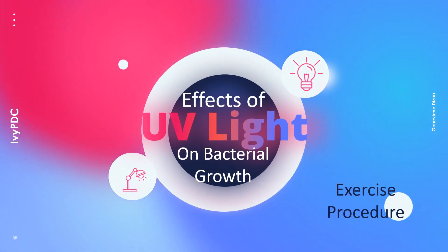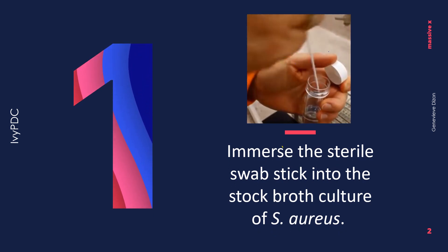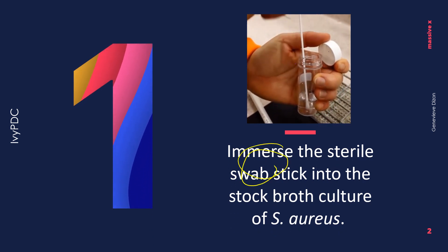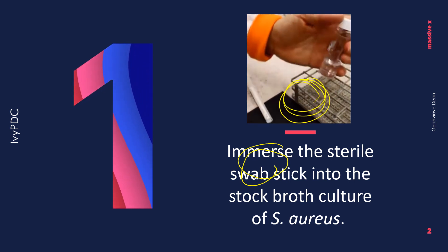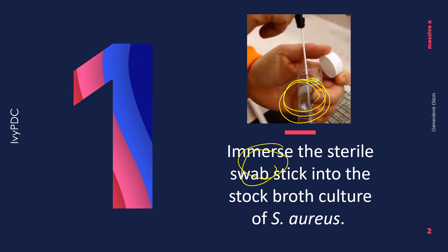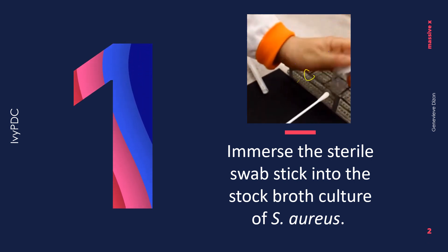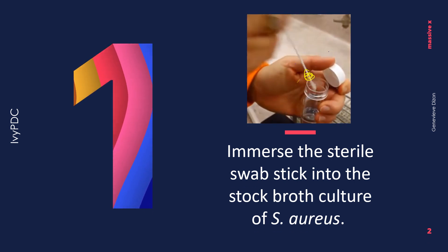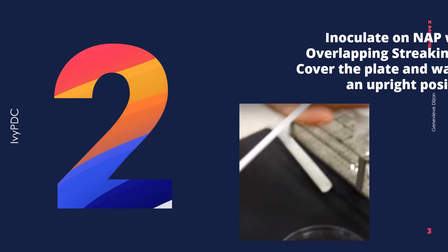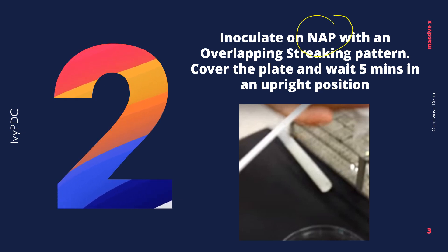Hello again everyone. This video will give the procedure for the effects of UV light on bacterial growth. The first step is to immerse the sterile swab inside the broth culture of the organism given to your group. Make sure that you gently squeeze the swab stick along the side of the test tube to remove the excess broth and prevent it from dripping.